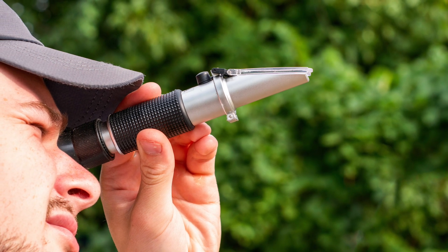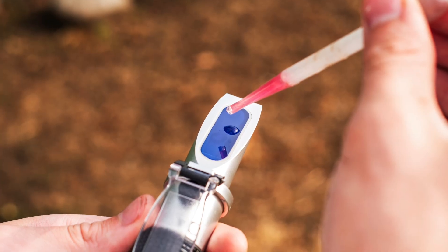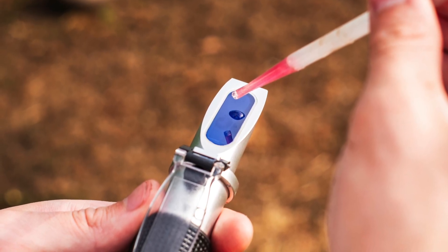There are two styles of refractometers commonly used in food processing: portable handheld refractometers and benchtop refractometers.